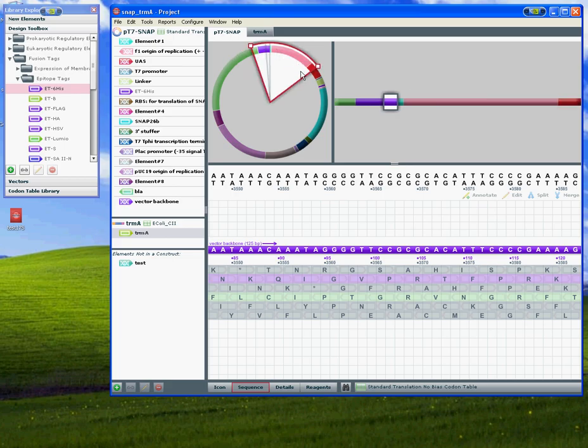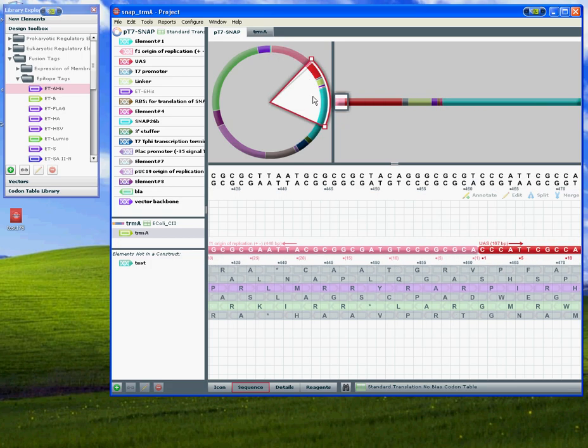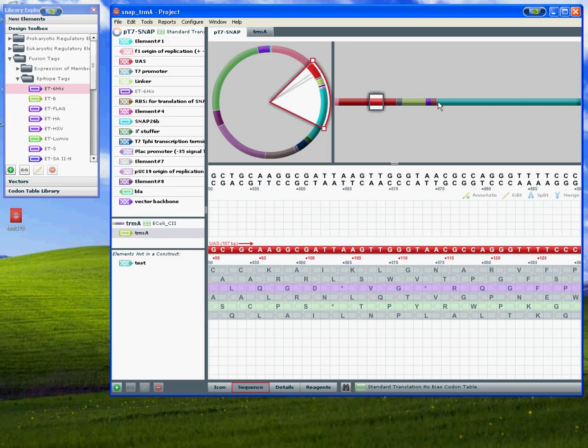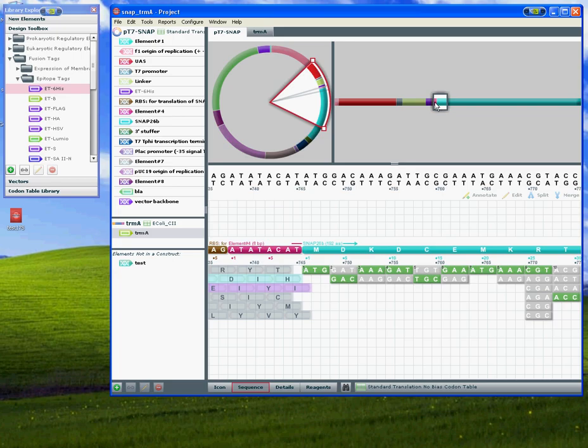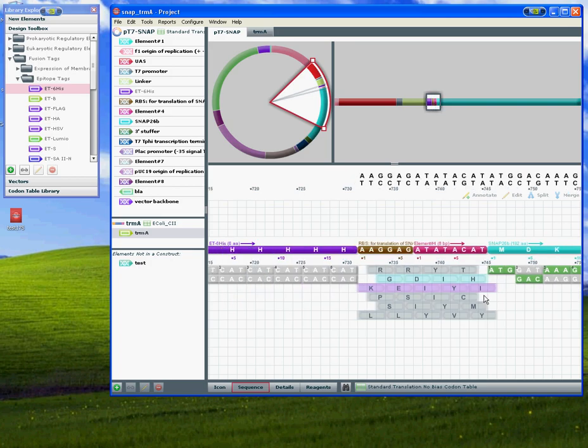On the first level, you can screen through the circular plasmid, and on the second level, drill down to a certain region. Here you have the corresponding DNA sequence and amino acid sequence.